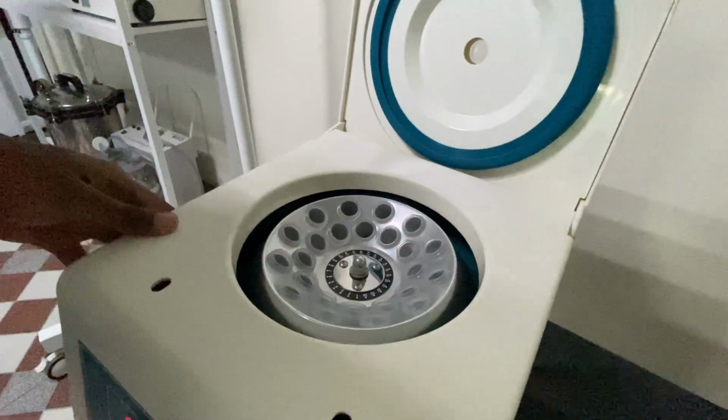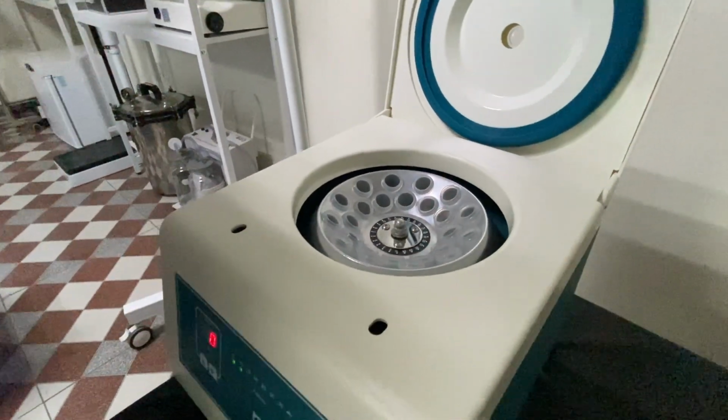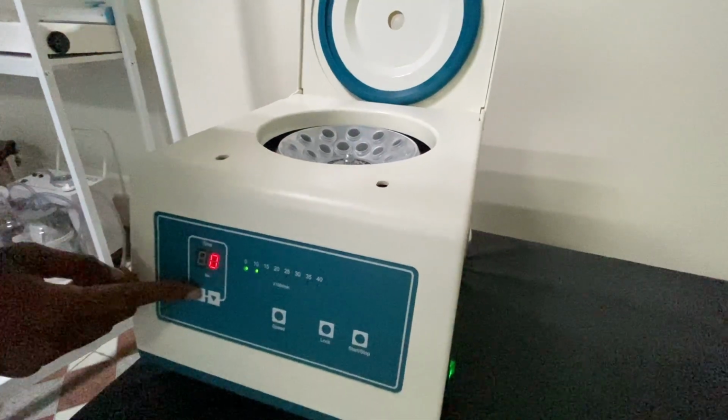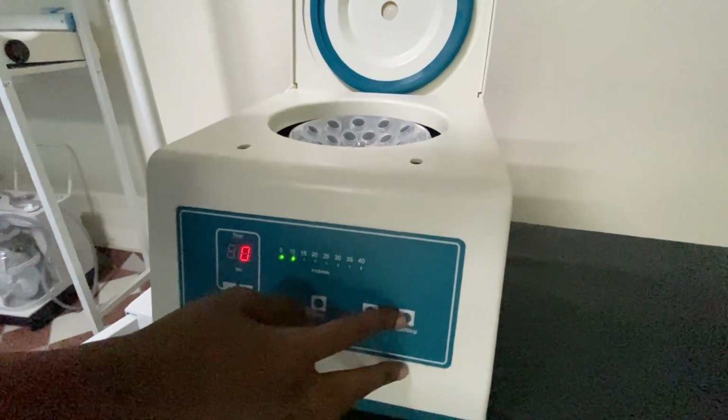So the centrifuge is mainly used to separate mixtures of different densities using centrifugal force. So I can just demonstrate to you. You pick your minutes. Maybe we just go for one for the demonstration and we start.